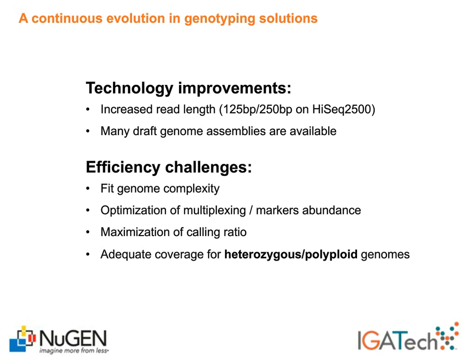It's also worth mentioning that some approaches of genotyping by sequencing rely on a very low coverage per locus, sometimes leveraging the ability to trustfully genotype inbred lines with a single haplotype, or the ability also to perform some imputation. However, this is not the case when dealing with heterozygous or even polyploid genomes, where imputation is not so easy and some prior information cannot provide robust imputation capability.